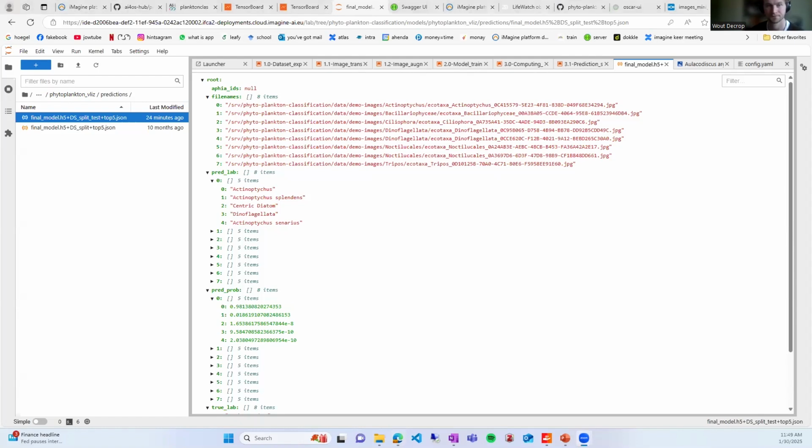Okay, thanks a lot. And there's one more question. Do you have a tool for biomass volume estimation calculation included already? So no, we don't have a tool to do this. We just have something to go from image to the prediction, but nothing yet sample based. You can put specific samples in there and look at the classes, but we don't have any estimations about the biomass or anything like that.